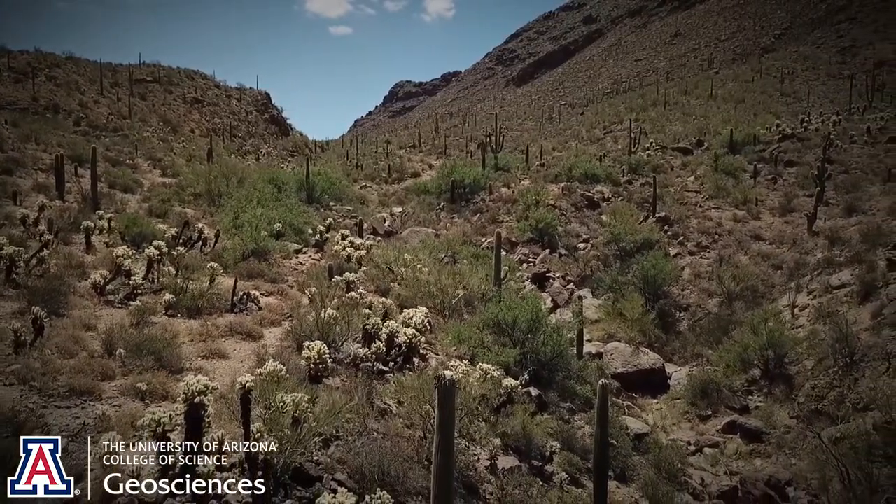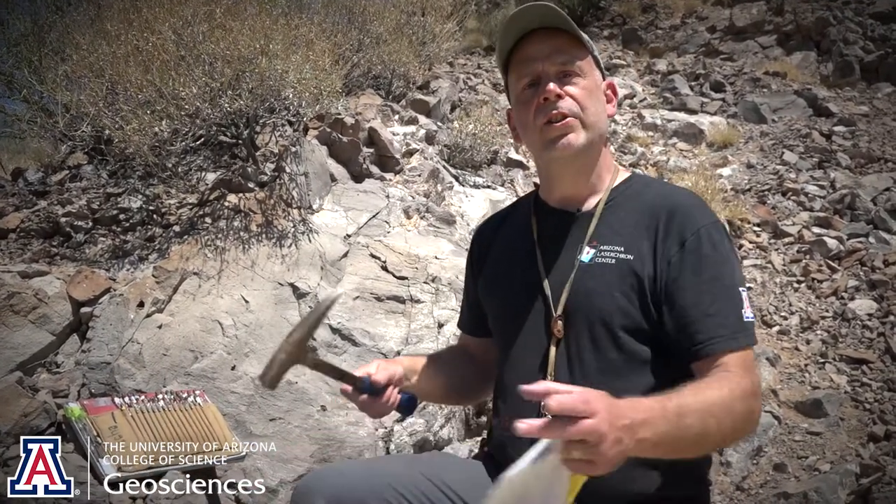Hi, I'm Mark Pekka, manager of the Arizona LaserChron Center, and we're here in the beautiful Sonoran Desert just west of campus. We're going to show you all the steps from collecting the rock to getting a final age in the lab.